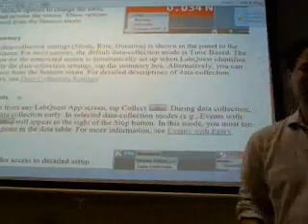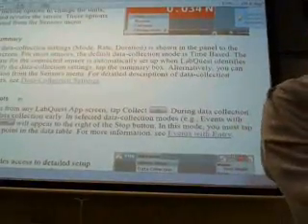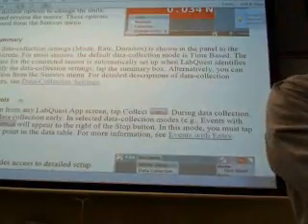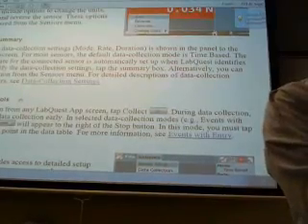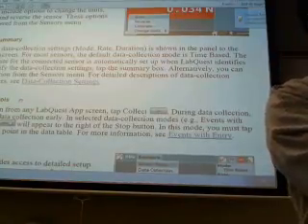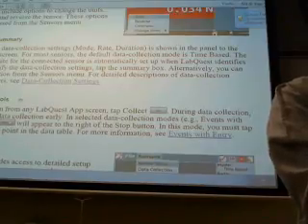Okay, let's try to find the summary box. The summary box is going to be located at the top, so it's going to be one of these little buttons at the top. Why don't you explore and see what the buttons do. Let's take a look at the left button. The left button tells us we're on the meter screen at the top left. Do you see that? We're just getting real-time output.